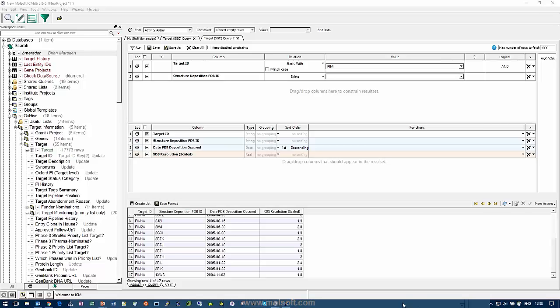Is it possible to share that query with your colleagues? Absolutely. So you see this thing here says share queries. What you can do depends on how you set up your Scarab and what permissions you give it, but it's possible to drag and drop your query into share queries or a subfolder within share queries, depending on who you want to share it with. That's eminently doable.